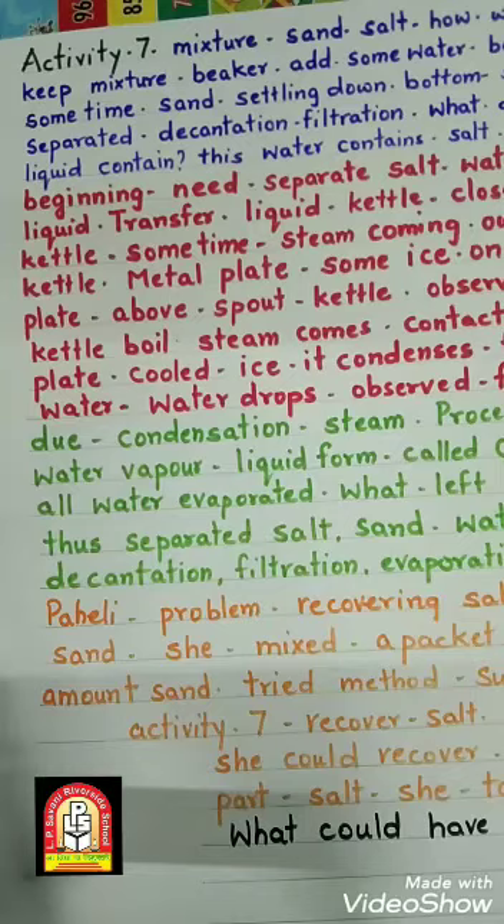Do you find something? Yes, we can see that the sand is settling at the bottom. The sand can be separated by decantation or filtration. What does the decantate liquid contain? Do you think this water contains the salt which was in the mixture at the beginning — whether salt is present in the water or not, that is what they are asking.